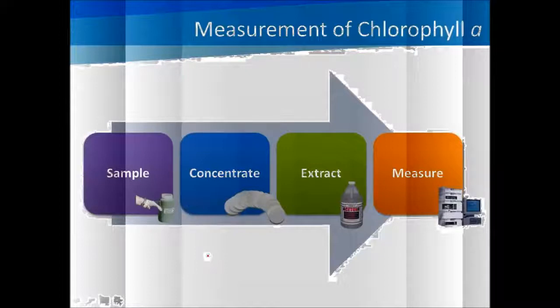So the standard method can be broken into 4 simple steps. The first is you go out and you take a water sample of sufficient volume. Then you concentrate that sample, typically through a filter medium.